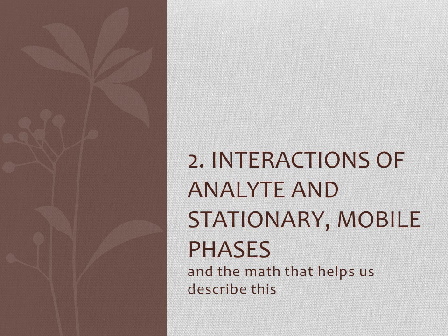Whereas another analyte who's less interested in shopping for clothes and maybe has greater interest in sports goods wouldn't spend as much time in a mall that's full of clothing stores. If I put them on a different mall and on a different column that was more full of sports stores, then they would be the ones retained a long time. So you get the idea of this different retention of different people, different molecules, based on their interests. And interests, of course, don't really relate to molecules. Instead, what we're talking about is things like polarity or size.